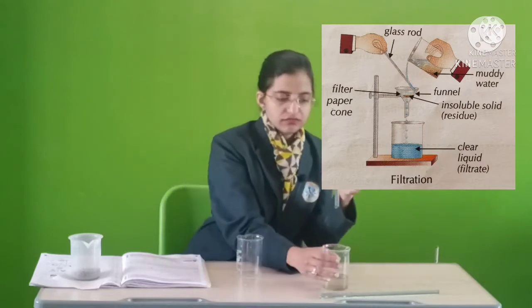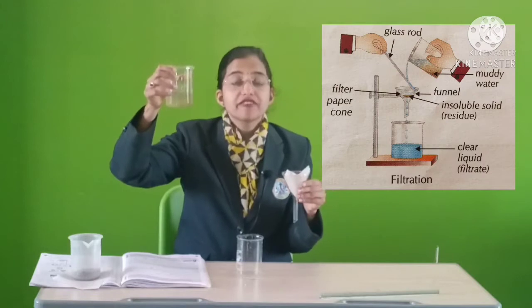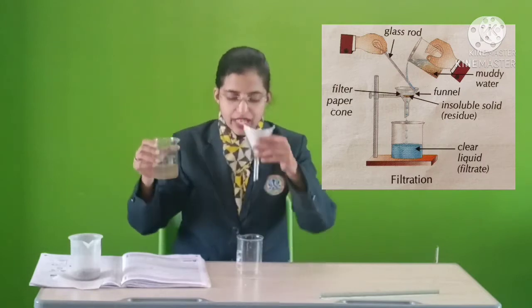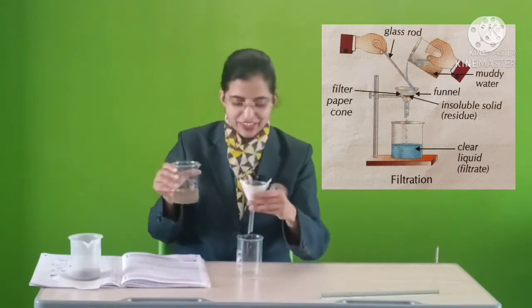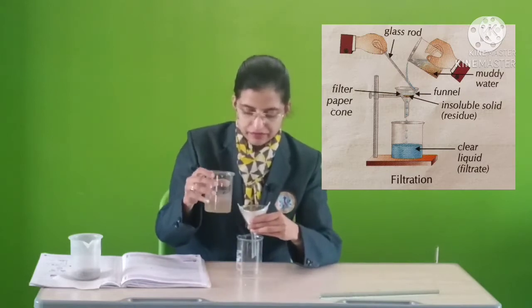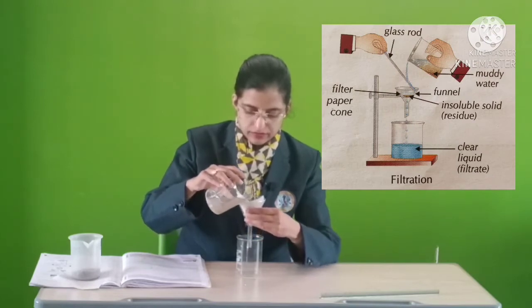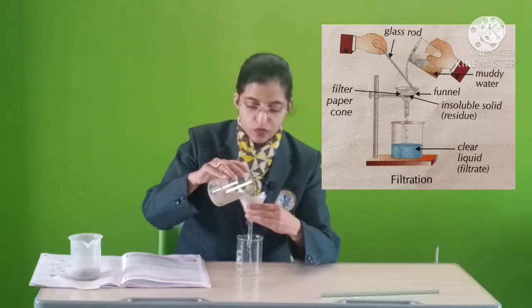And now this is the water which we got after decantation. And now I am starting my filtration. Let's see. See, I am getting clear water.